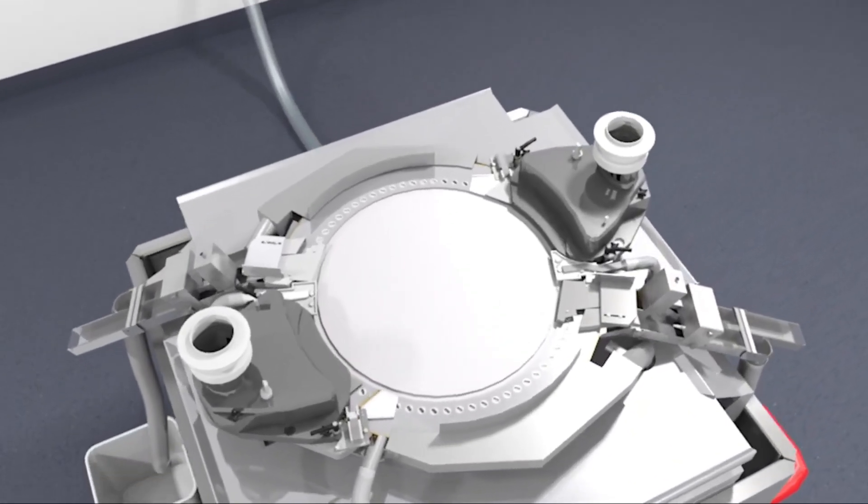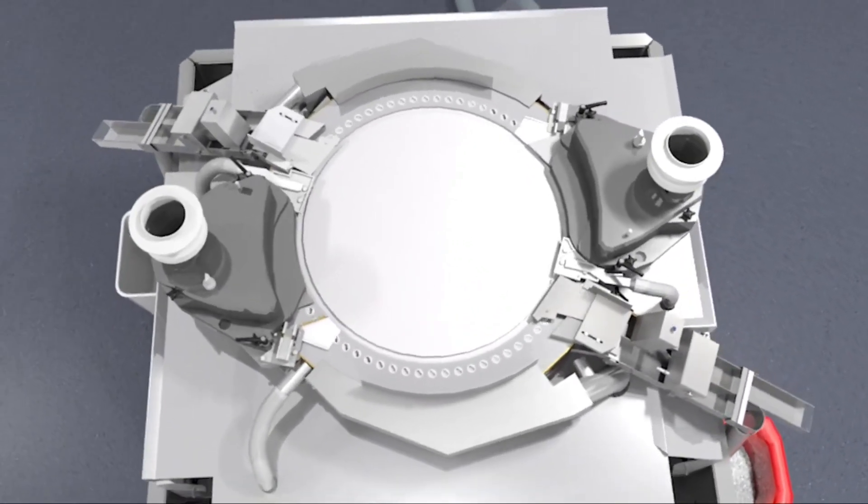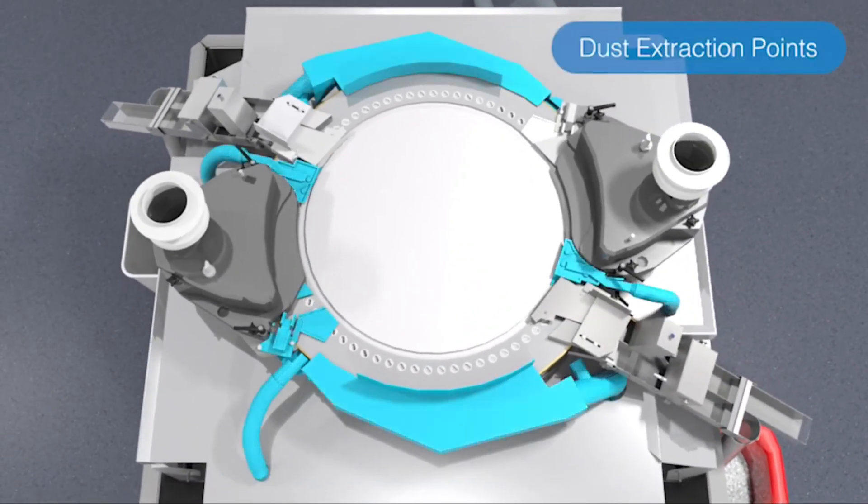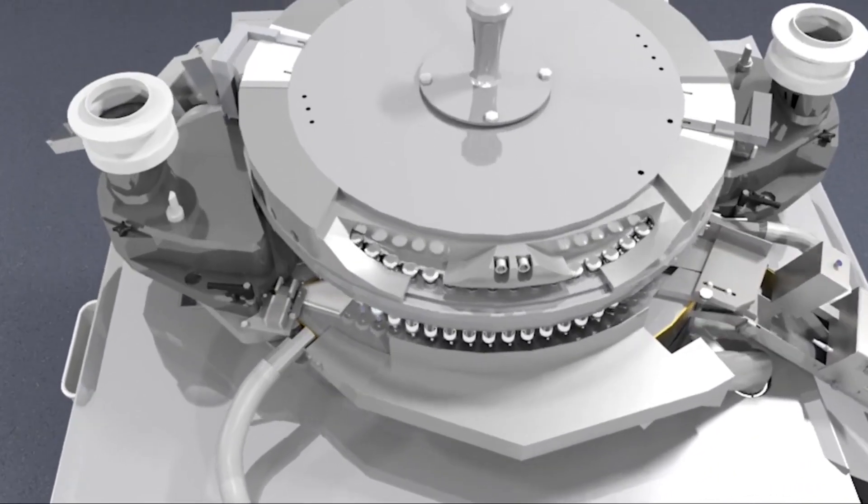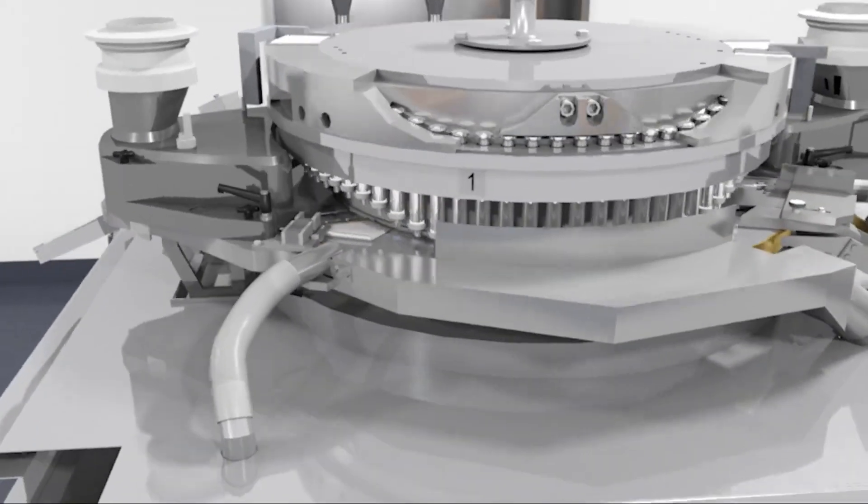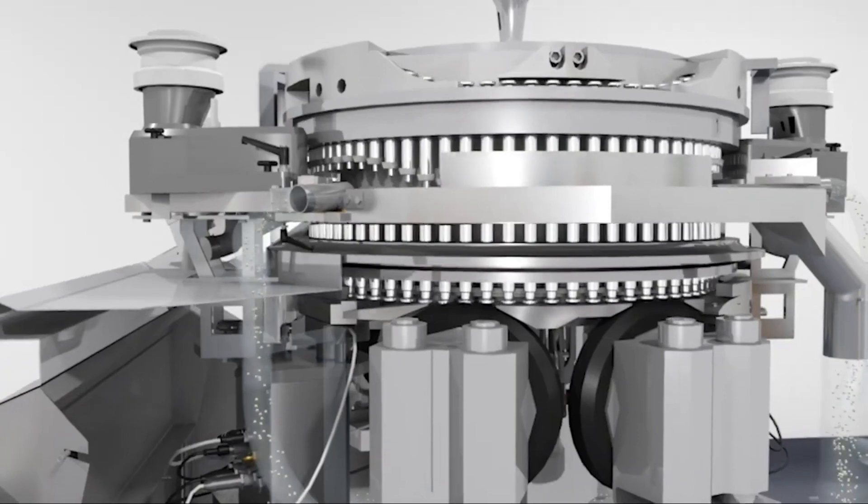During compression or encapsulation, excess dust is captured by internal extraction shrouds. Here, process material is lost to the central dust extraction system without the opportunity to account for the loss of material, as recommended by the FDA and other regulatory bodies.